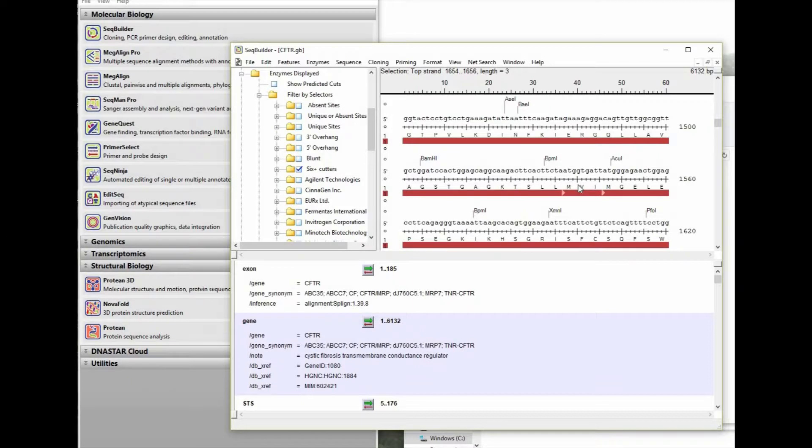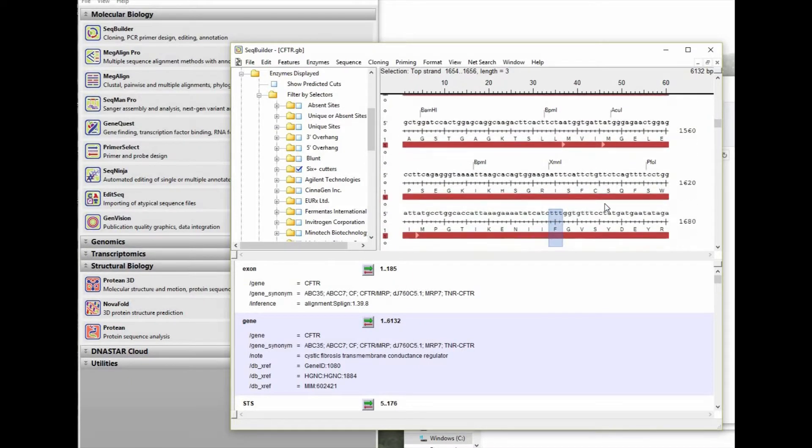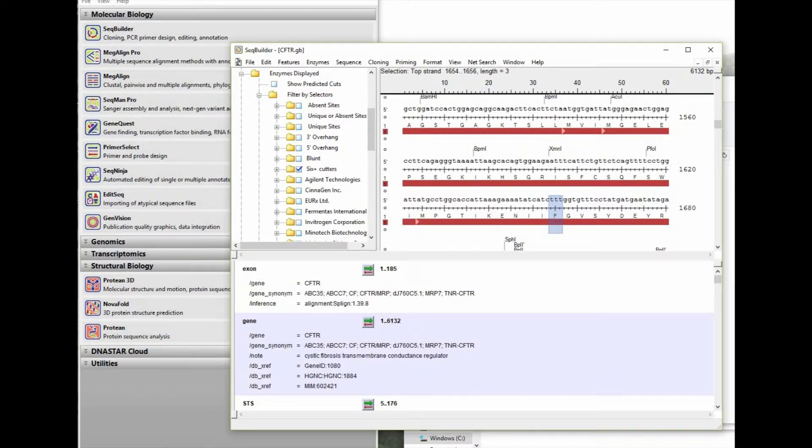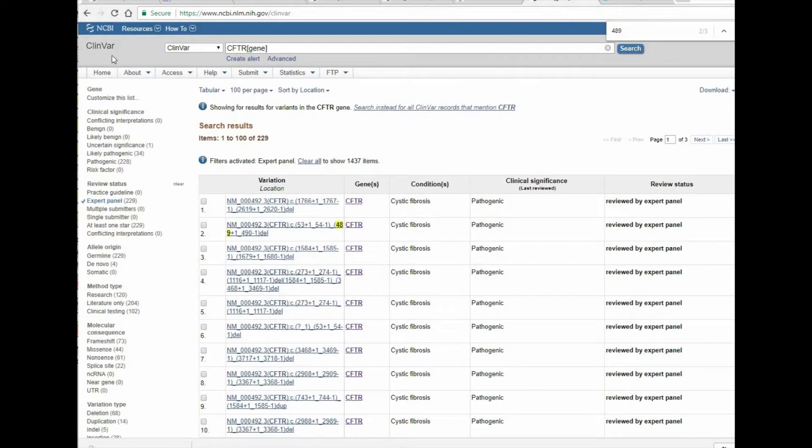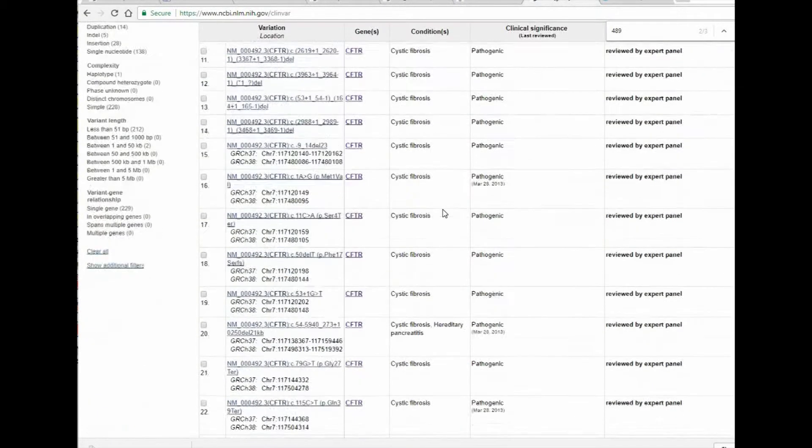So now that we've done that, we'll have to scroll back down just a little bit to find our site. But unfortunately, there are not any restriction enzyme sites near to the phenylalanine at 508. So let's go back to ClinVar and see if we can find another alternative.